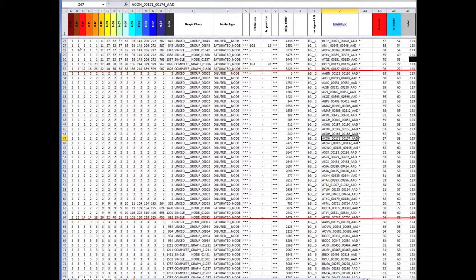If you read this correctly, all the markers from, say, line 26 to line 32 are in group 1, actually down to a 0.18 recombination frequency. As you get tighter, you get fewer of these markers, and these are basically group numbers. If you look at group 2, you see the same thing. These markers are very tightly linked. These are actually all in the same genetic bin, because there's 0 recombination. You can slide over and decide: at 10%, these markers are all together. At 20%, basically all the markers are together.